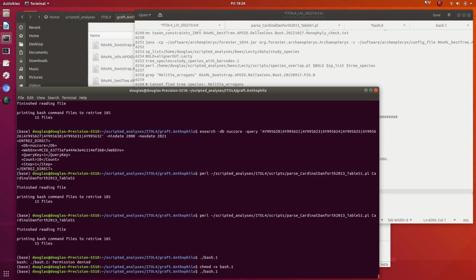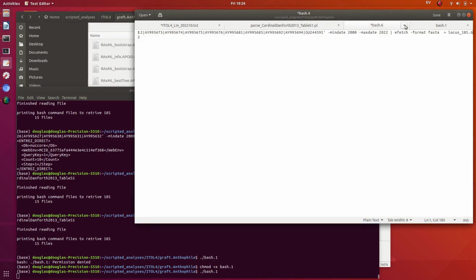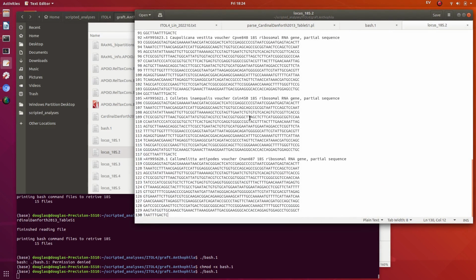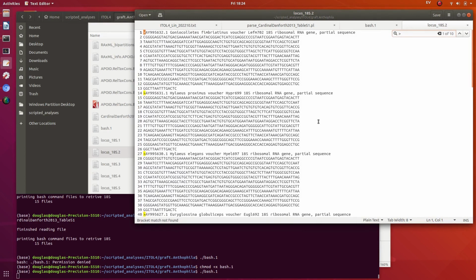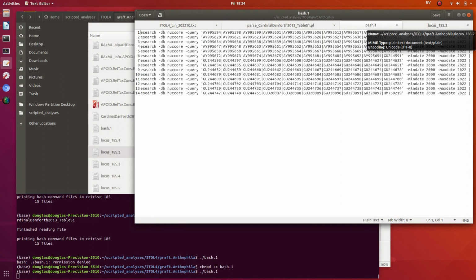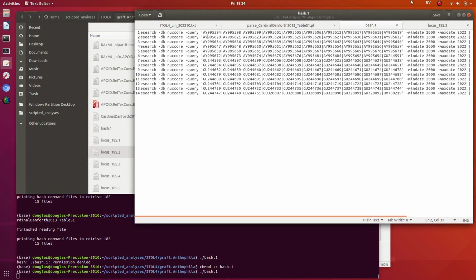Okay, so this is doing something. Yep, expected number of entries. So our output file number 2 should contain these.